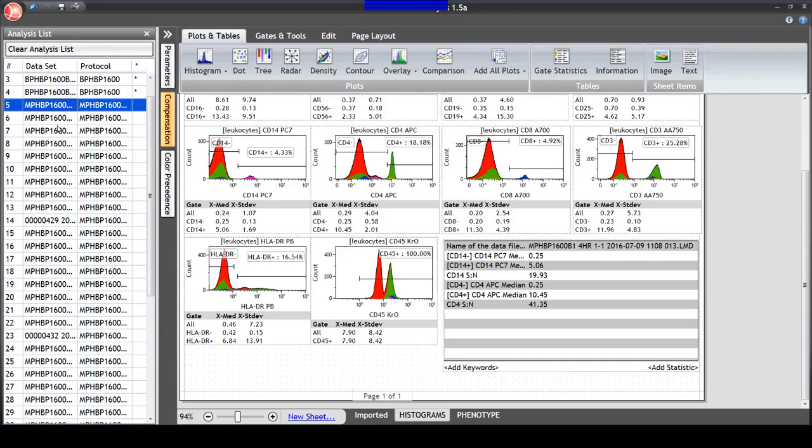How do I put it together and make any conclusions? Well, I could make a report. Or I create a new sheet and have my phenotyping tab be a report of all of the statistics associated with my history. Right? Because over time you don't expect that the populations will stain perfectly. So I've just created a few examples here, and I will show you how I did that.